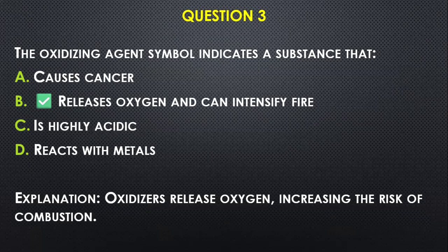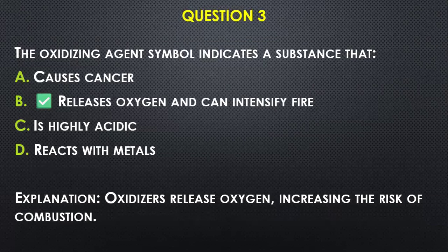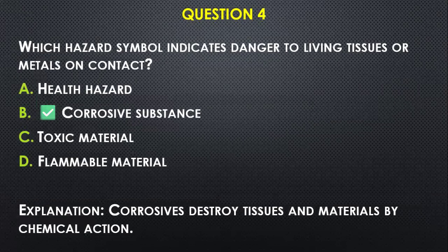Question number three: The oxidizing agent symbol indicates a substance that — A) causes cancer, B) releases oxygen and can intensify fire, C) is highly acidic, D) reacts with metal. I would go with B, because oxidizers tend to release oxygen, thereby increasing the risk of combustion, and if combustion is already in process it can help to intensify the fire.